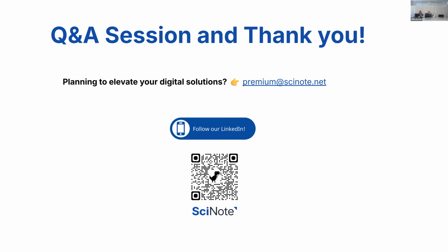Okay, then a question from Andy. I have a quick question regarding parent-child relationships on SciNote. We have bulk material that we aliquot for easier use. Is there a way to deduct from the parent to the child? To deduct from the parent to the child?